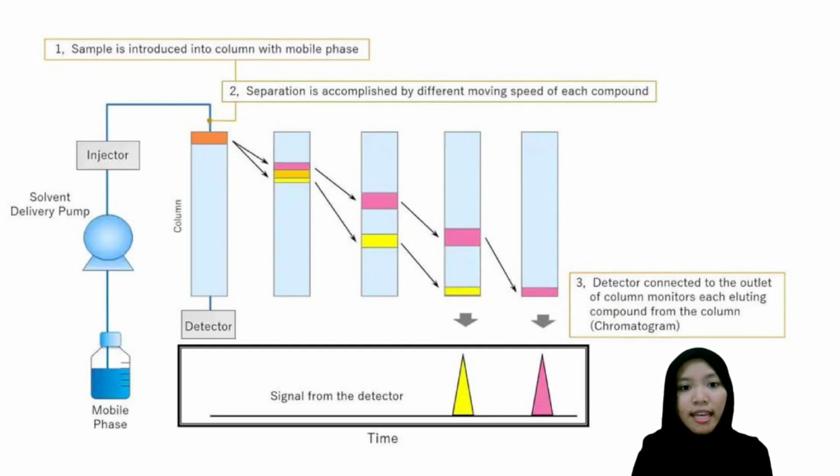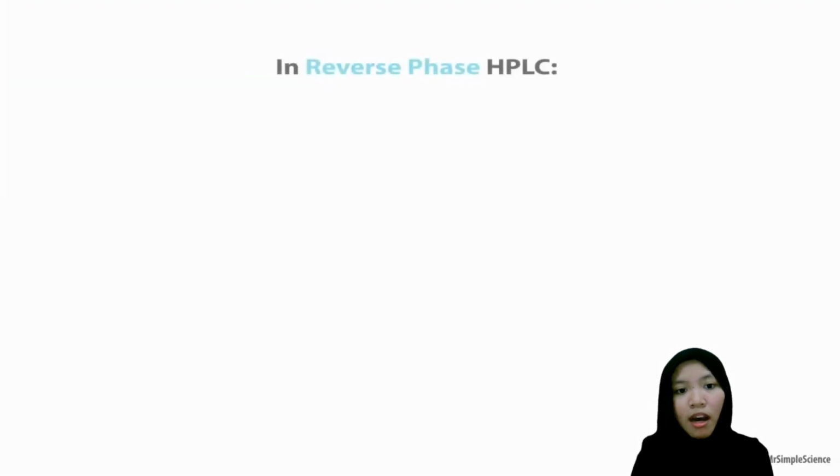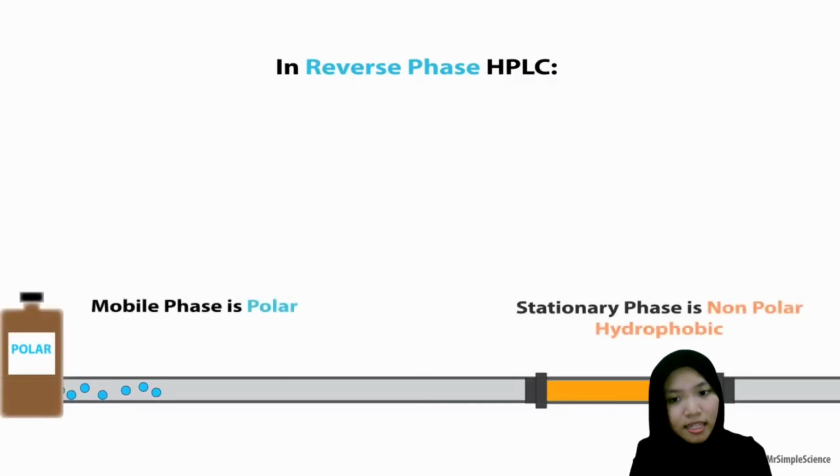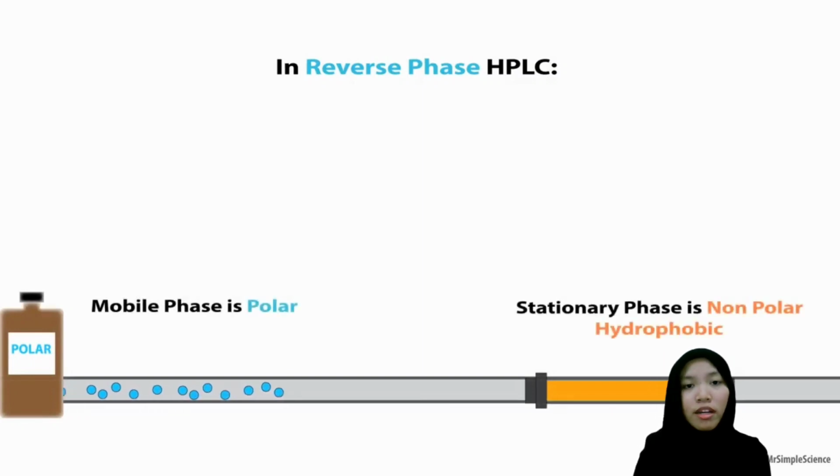For this specific case study, we use reverse phase chromatography for quetiapine fumarate, where the reverse of the above applies: the stationary phase is very nonpolar, while the mobile phase is relatively polar. In this situation, the nonpolar compounds elute later than polar compounds. Therefore, the elution speed in the column depends on the affinity between the compound and the stationary phase.